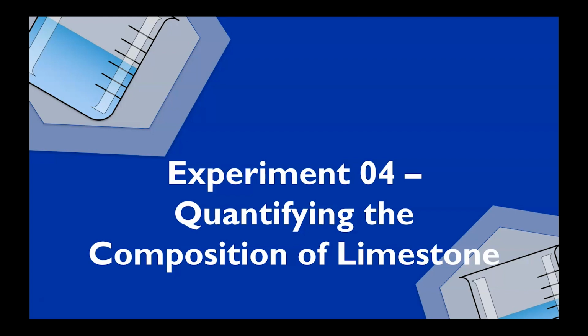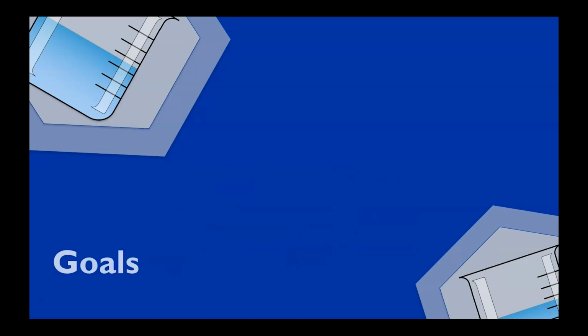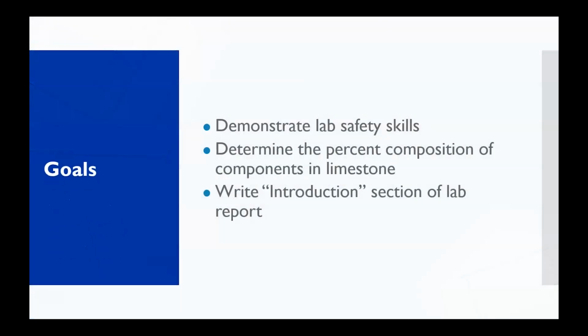In this experiment, we're going to determine the percent composition of chemicals in limestone. Goals. In this lab, we're going to determine the percent composition of calcium carbonate in limestone. We're also going to learn how to write the introduction section of our lab report.